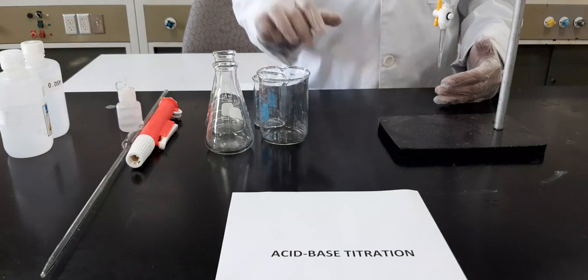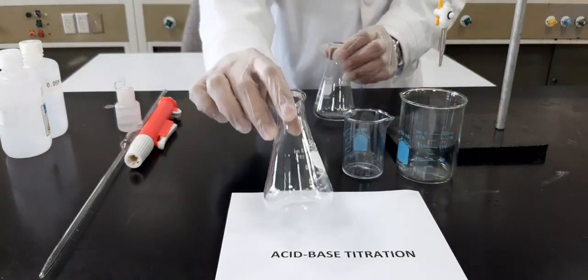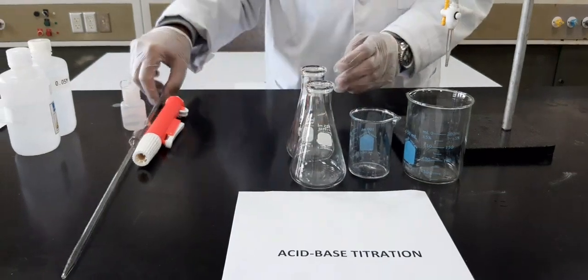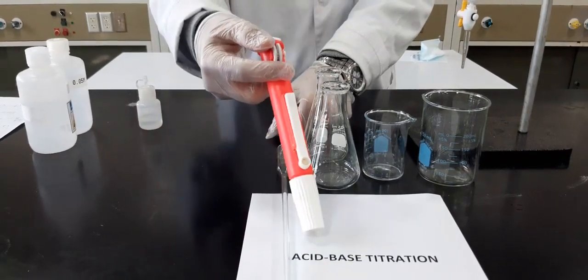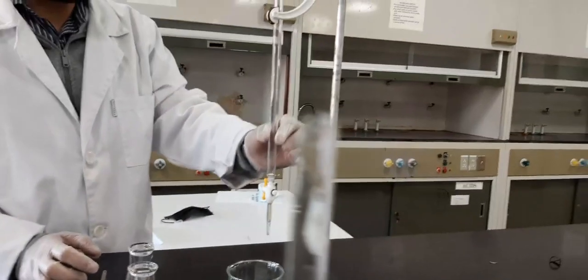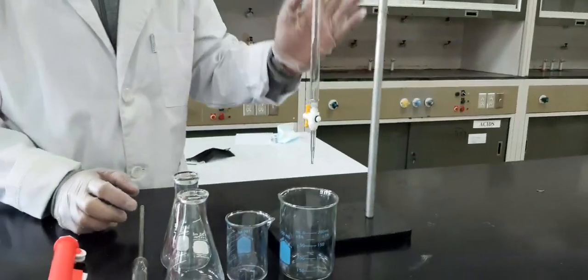in this experiment. We have beakers. We have conical flasks. This is a conical flask. We have 2 or 3 conical flasks. And we have a pipette. This is called a pipette, 20 ml pipette. And then we have a pipette filler, and the last thing is the burette. This one, the one in the clamp, is called the burette. The stand and clamp are already there.